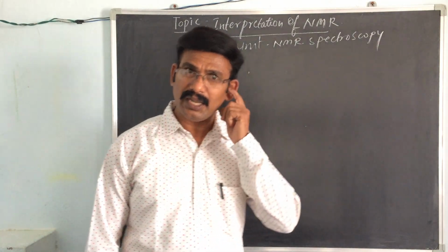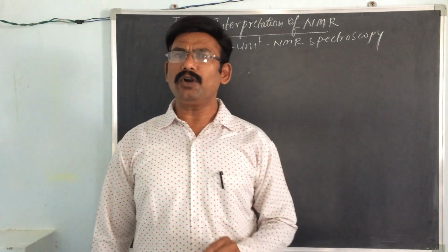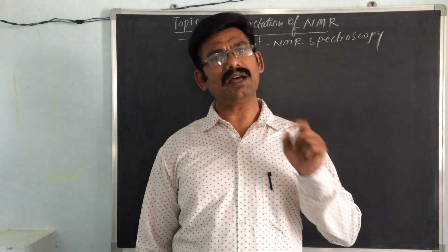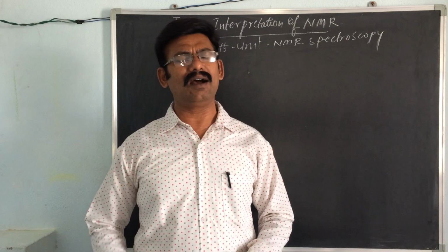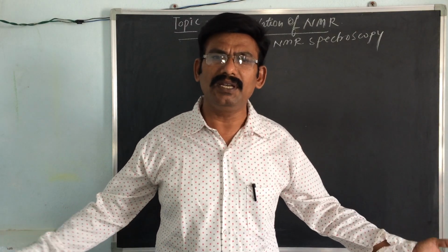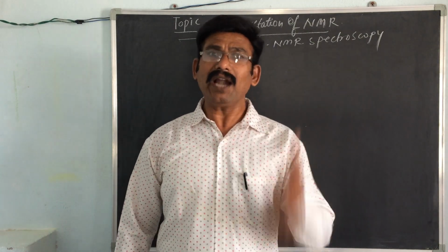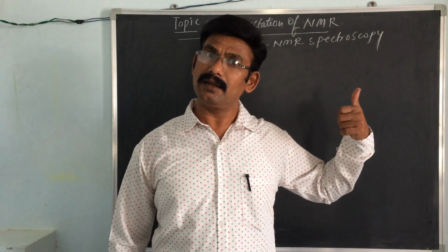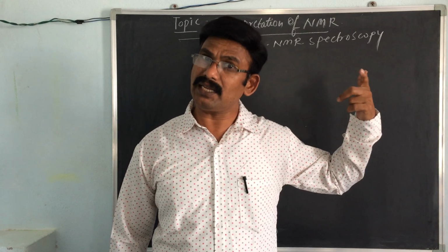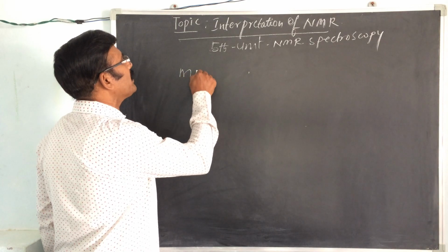For example, 3 spectra are very important for the identification of all organic compounds, all medical compounds. The 3 spectroscopies are more important. What are they?